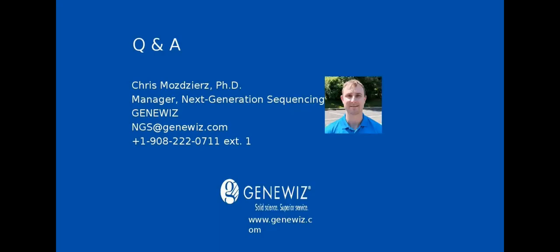Okay, so the first question coming in, do we need to validate NGS results using Sanger sequencing when we are targeting multiple genes using multiplexed assays? It's a great question, and as I described during the talk, it is a good idea to validate your NGS data. With multiplex PCR, there's many different types of validation that you could do. First part of the validation would be prior to actually doing the multiplex PCR, but after you do your NGS, it's certainly a good idea to validate any interesting variants that you find. And researchers, depending on the minor allele frequency, either choose Sanger sequencing or qPCR.